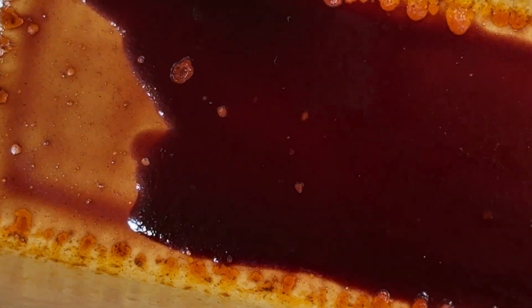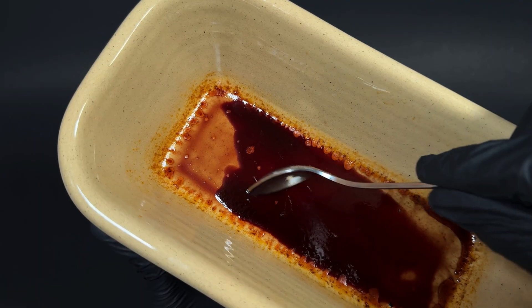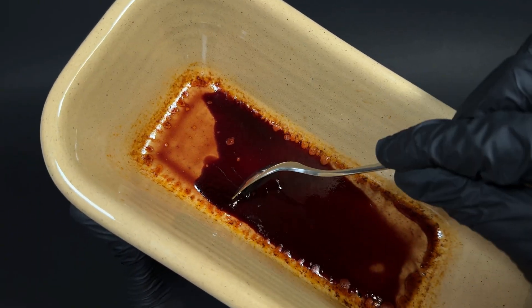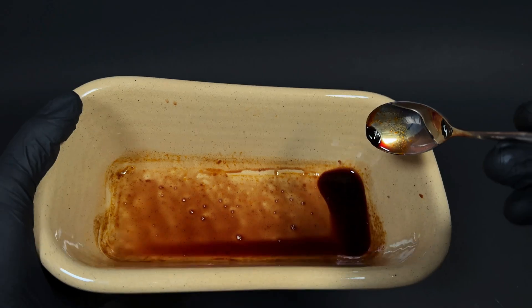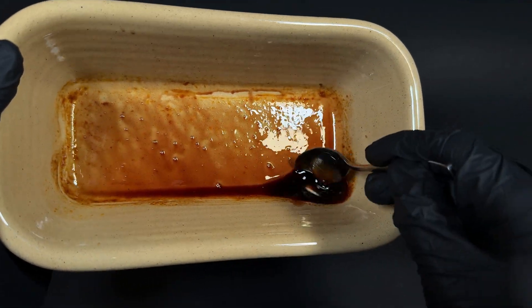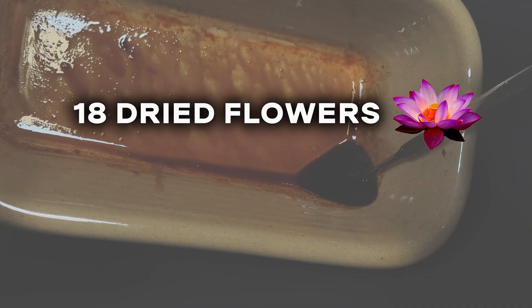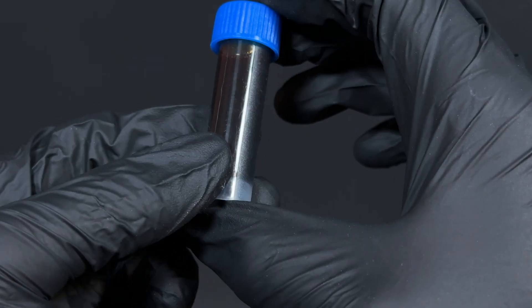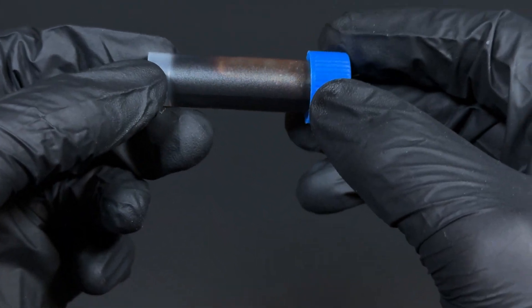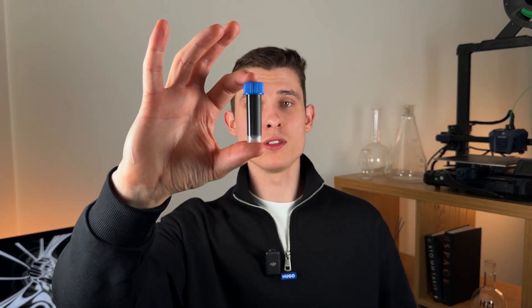Since the nuciferine content in the flowers is incredibly low — micrograms really — I won't be isolating it separately. I want to transfer this resin into a vial, but in its current state that's going to be a bit tricky. So I'm adding a bit of ethanol to dissolve the resin back, making it easier to transfer. To put things into perspective, contained in this extract is roughly 18 dried flowers. A standard tea usually contains just one flower. Since nuciferine barely dissolves in water, the amount in tea is practically negligible. So in crude terms, this vial contains nuciferine from 18 flowers. Sounds promising.